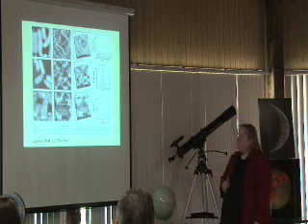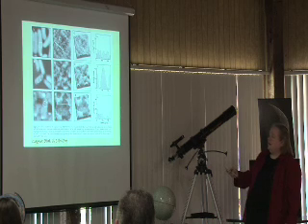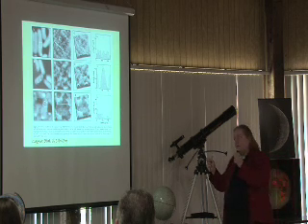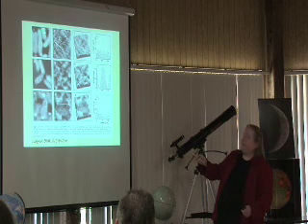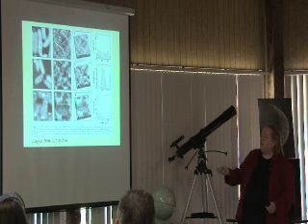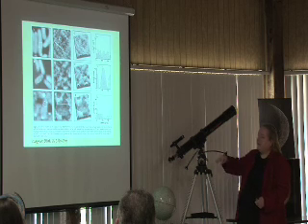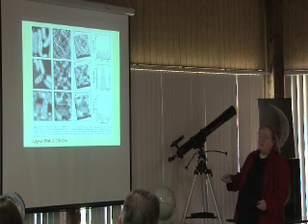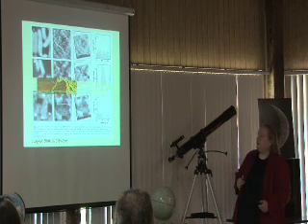This is a study that was done by my advisor in Detroit at Wayne State University, where they looked at metal treatments of the surface and looked at how the surface changed. So these are the healthy bacteria on the top row, and these are the treated bacteria where you can see that something called the LPS layer, the surface layer of lipopolysaccharides, was removed by the treatments of the drug that they were studying, how these drugs affect bacteria.